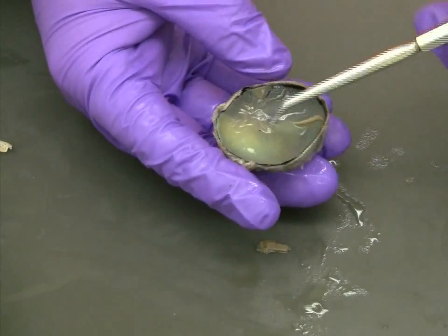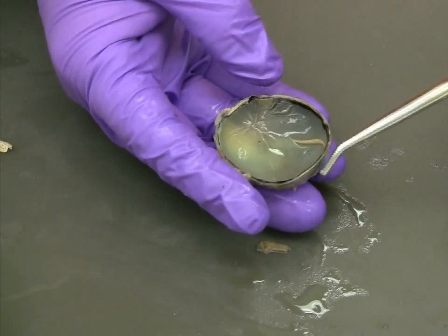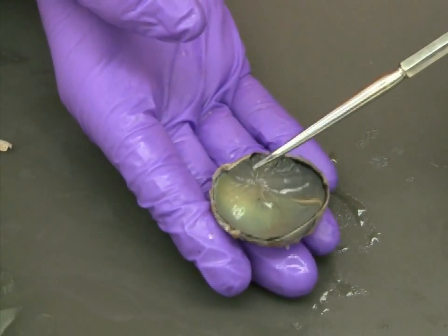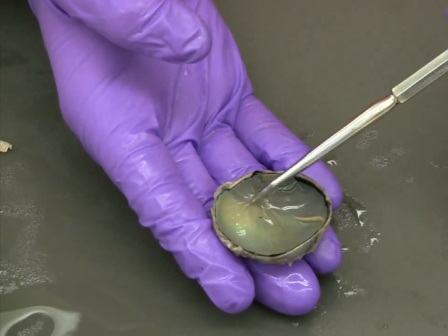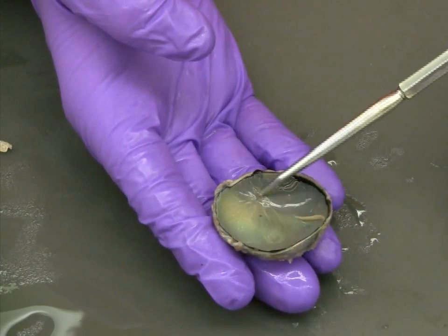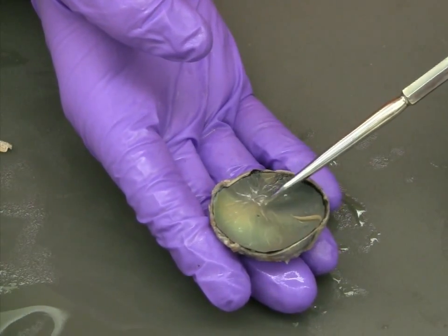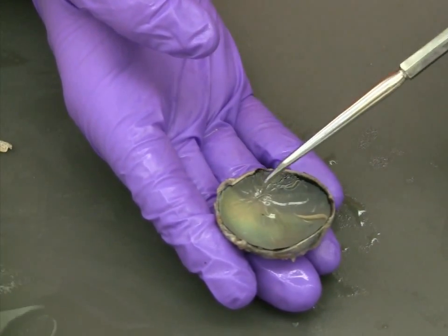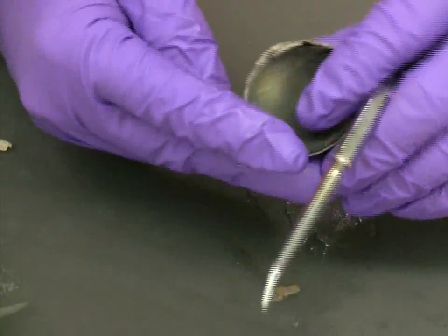With the vitreous humor removed, the blind spot is one structure of the retina that can be easily identified. Look for folds in the retina membrane where it appears to disappear into the wall of the eye. This spot corresponds with the blind spot and also the optic nerve on the outside back of the eye.